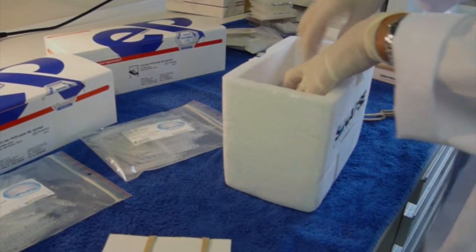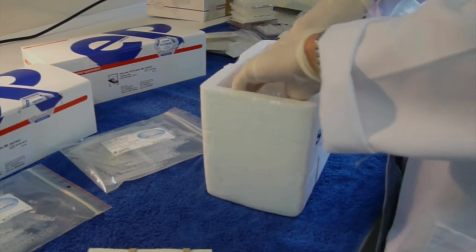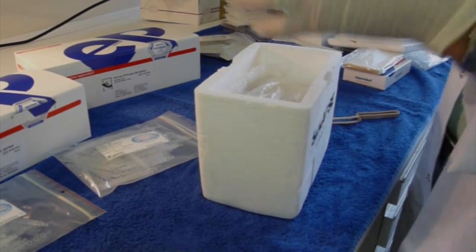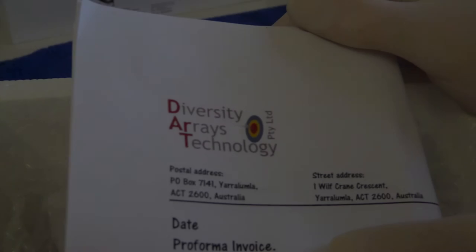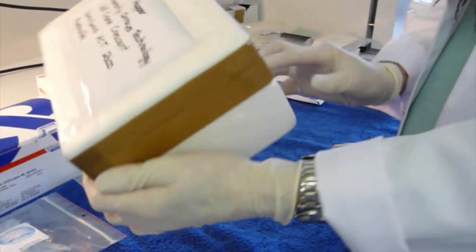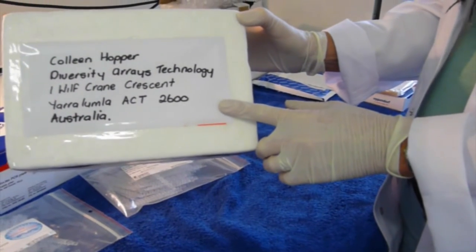We recommend you use a box appropriate in size to the number of plates that you will be sending. Line the bottom of your box with bubble wrap, place the plates inside the box, then add bubble wrap down the sides and on top to make sure the plates are in a secure position. Place all your documentation inside the box, then seal the box securely with packaging tape, and then address the box to Diversity Arrays on top.